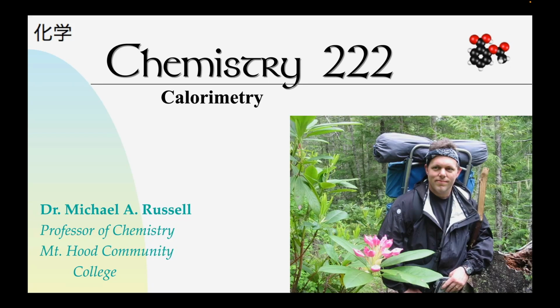Greetings and welcome to the Chemistry 222 Calorimetry Lab, where we're going to look at heat transfer and see how it applies specifically to chemistry. Along the way, we'll also look a little bit at the difference between a Q and a delta H, and we'll use Hess's law to figure out the delta H of formation for zinc oxide. So without further ado, let's get into this cool lab.